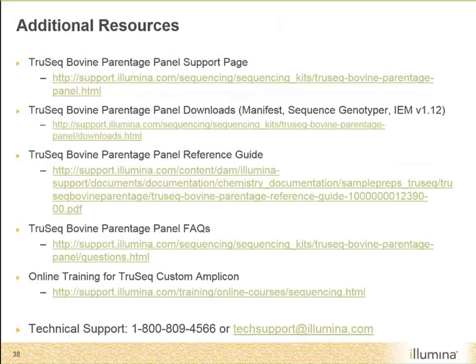And lastly, I want to leave you with a few resources that are related to the TruSeq Bovine Parentage panel, the support page. The support page has a lot of great information, including the user guide, protocol guide, where to download the manifest, how to download sequence, where to download Sequence Genotyper, Illumina Experiment Manager, and I'll also have some great FAQs there that if you have any questions, you may be able to find them there.